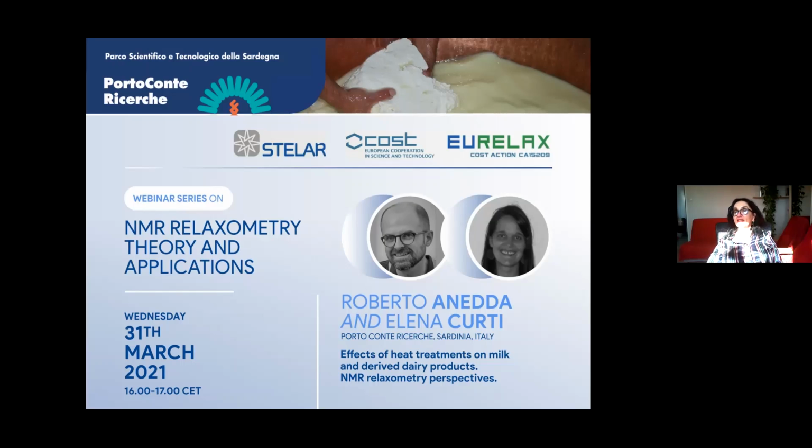And the title is about how one can use NMR relaxometry to investigate effects of heat treatment in dairy products. And this is the kind of thing that I suppose we are really looking forward to, because this is a very important application of NMR relaxometry.